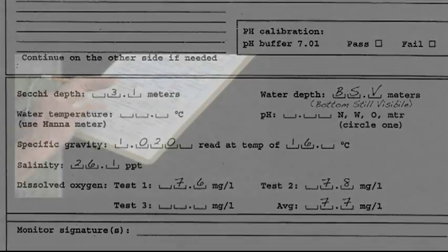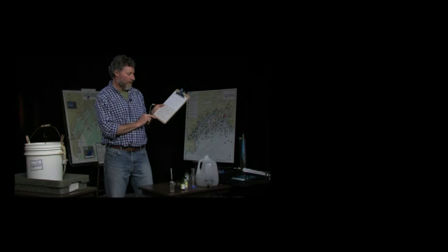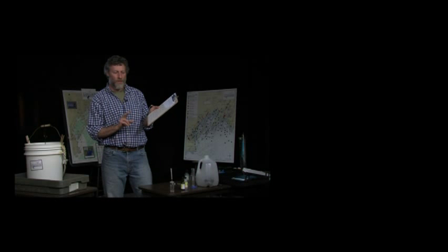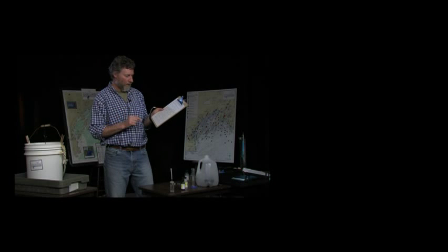If you did process 3 dissolved oxygen tests, we would ask you to average the 2 that are closest to each other and give us an average to it. Our database, when we put the data in, we're only allowed to put in 2 readings that are closest to each other. We can't put all 3 of them in.